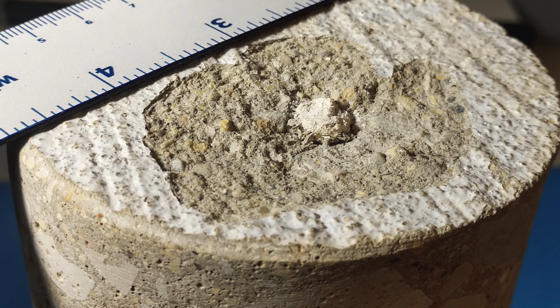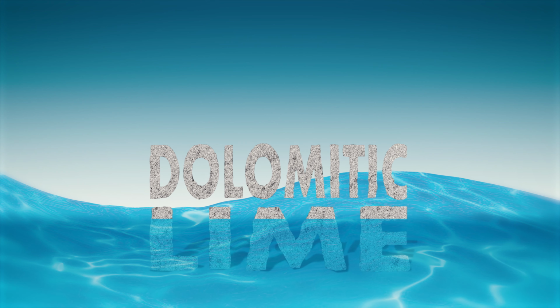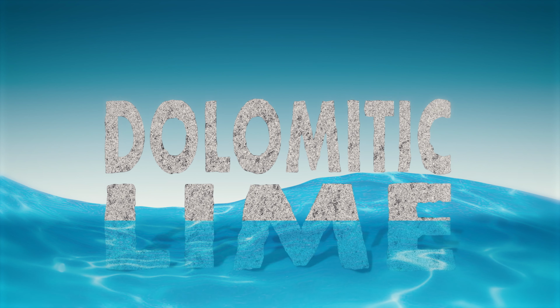It's the hydration of this oxide that caused this surface distress. Hydration of oxide is an expansive reaction. The volume doubles in this chemical reaction. Now David is going to show how this instrument is helping him solve problems.